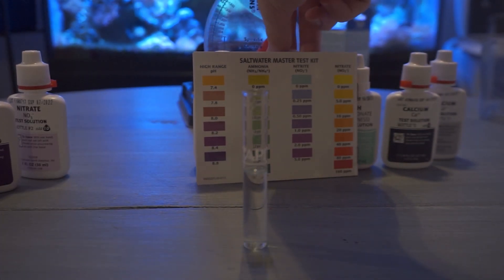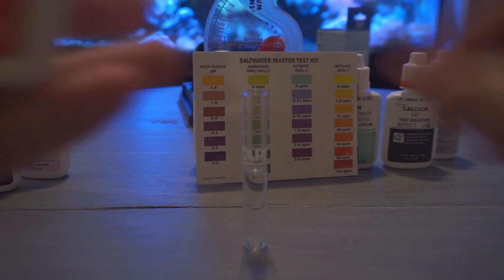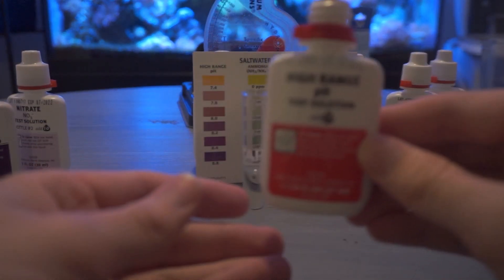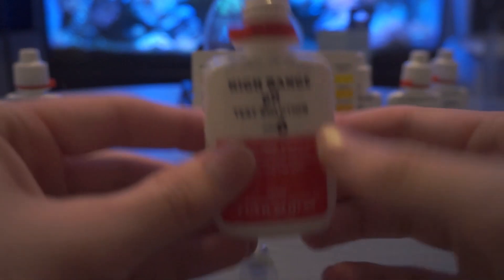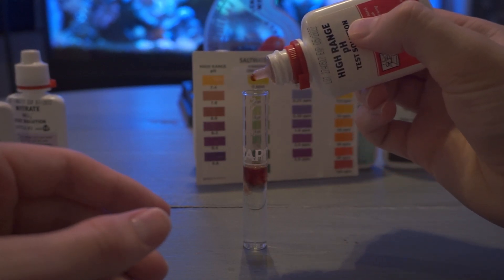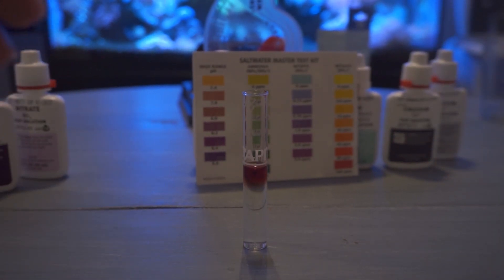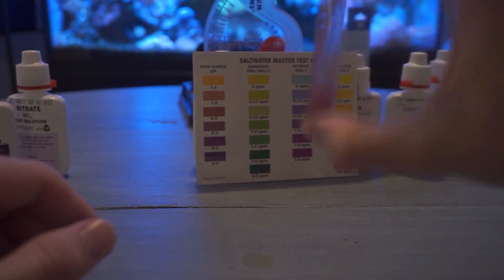Now once we get our next test tube ready we're going to be testing the high range pH. So this one we're usually trying to hit 8.1 to 8.4 in a saltwater tank. You definitely want to keep it in that range to keep your corals healthy. On the bottle it's real simple just add five drops shake it up and we'll see what coloration we get. We'll put the cap on give it a good shake and this one usually changes pretty quick for us but we'll still let it sit just in case.